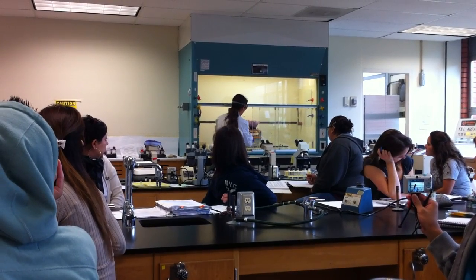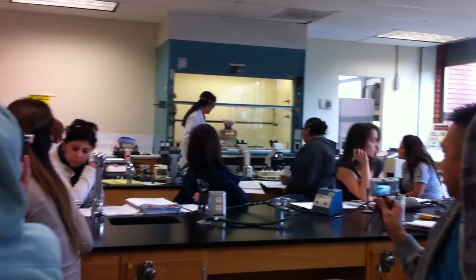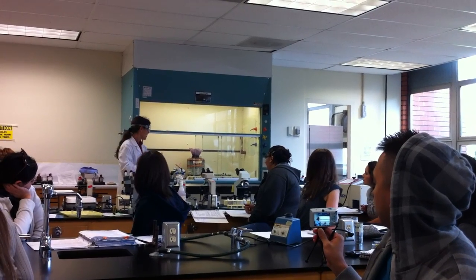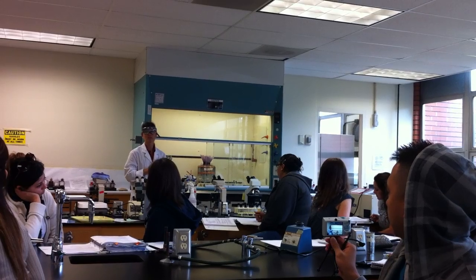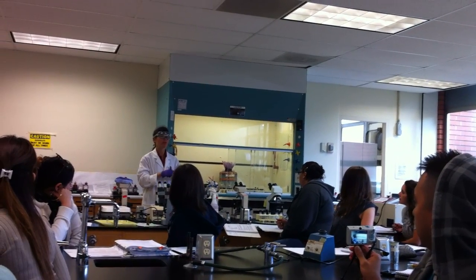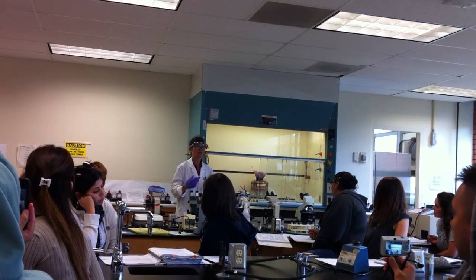Okay, so I'm going to bring my tubes over here. We'll get another test tube rack for you guys. I'm going to put my tubes here in the safety hood, and then I want to make sure that I have my reagent. You guys know we need two reagents, VP reagent A and VP reagent B. If you ever work in a lab, never let people tell you, oh, use reagent A, reagent B. You want to know exactly what those reagents are, right? That's important to protect yourself.